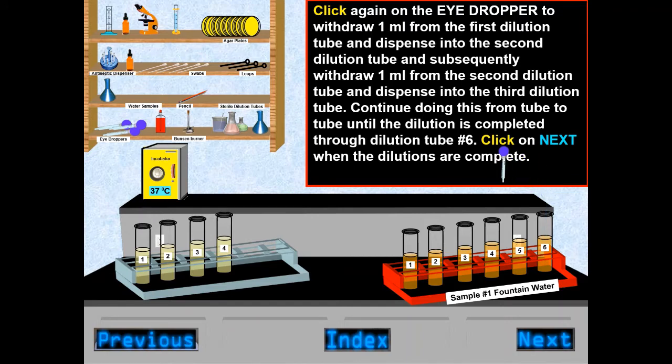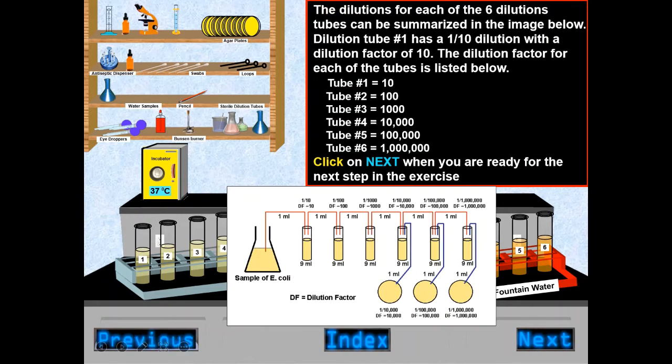This step of tube to tube dilution was continued until the dilution is completed through dilution tube number 6.